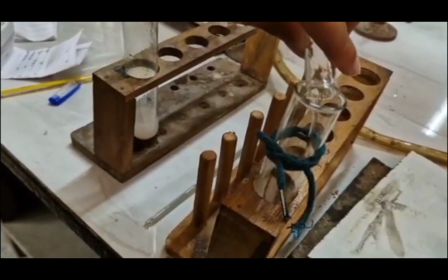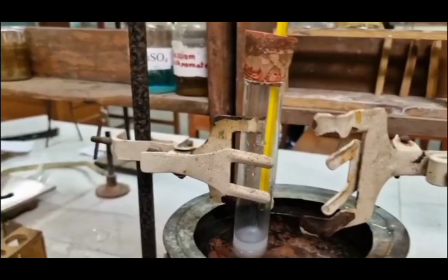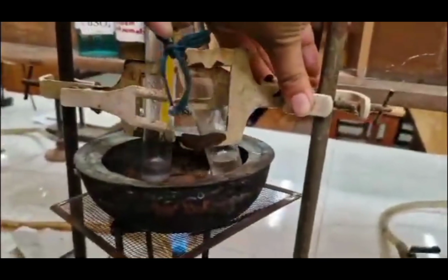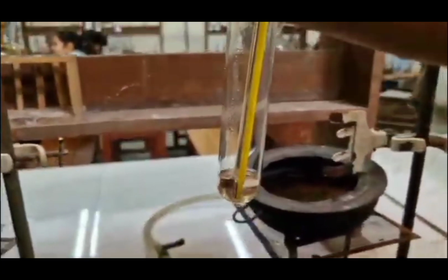Again add 2 ml water in both systems and heat it and note down the temperature when turbidity disappears. Here we can see that turbidity disappears and note down that temperature also.